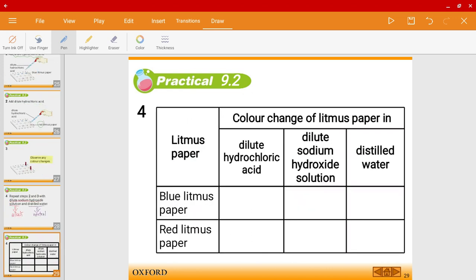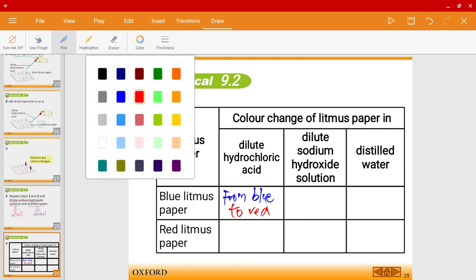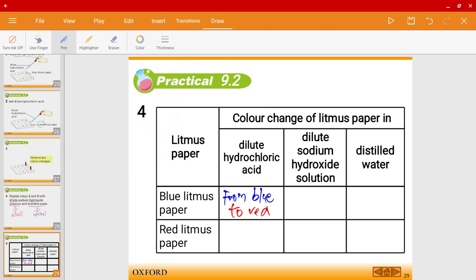Let's see what happens to the color changes. For dilute hydrochloric acid, the blue litmus paper changes from blue to red. For dilute sodium hydroxide solution, it remains blue. And for distilled water, it also remains blue.